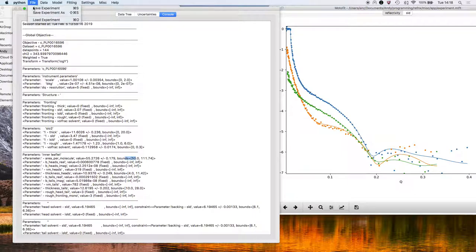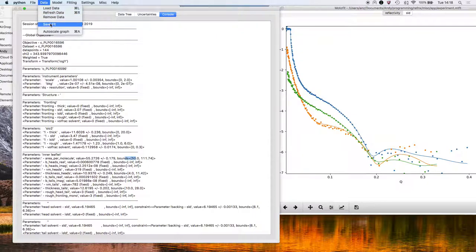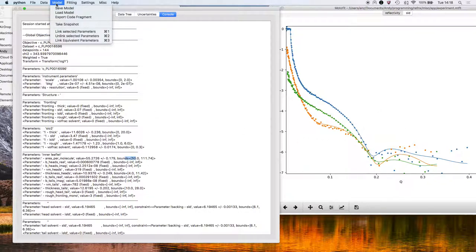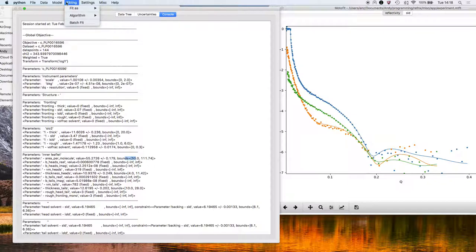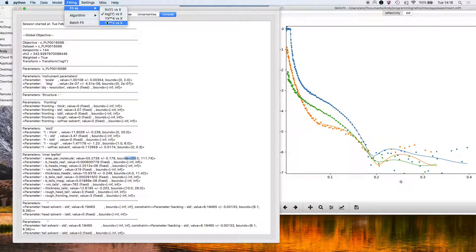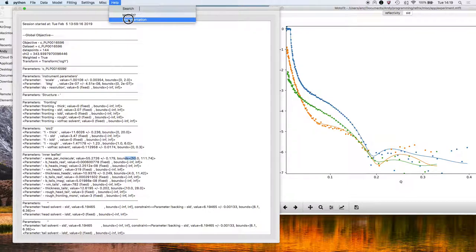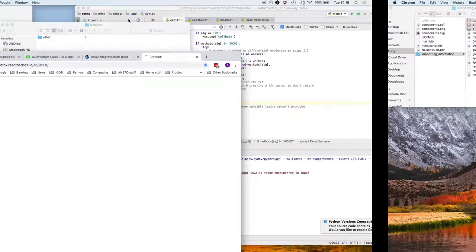Once I've finished that, I'm going to save the experiment so we can come back and get these parameters. A few of the model options. We can load extra data in or refresh the existing data, save those fits in here to put them into another graph plotting program. We can choose different algorithms to fit. We can fit as lin r versus q, log r versus q, r squared versus q and so on. There's also a scattering length density calculator. And finally, you can find the documentation for refnx on the web.